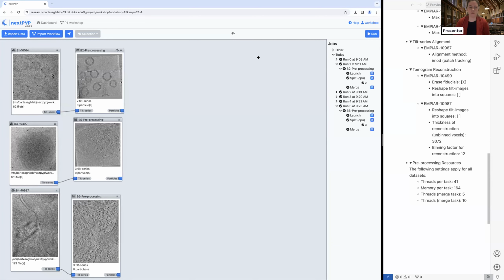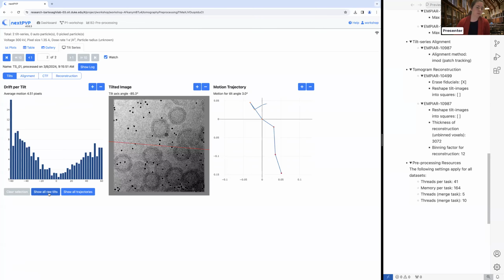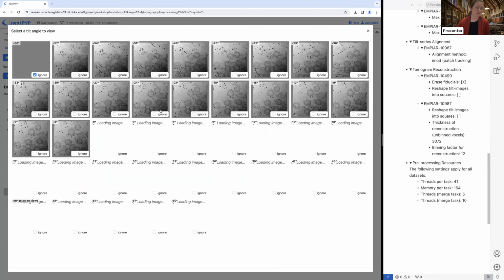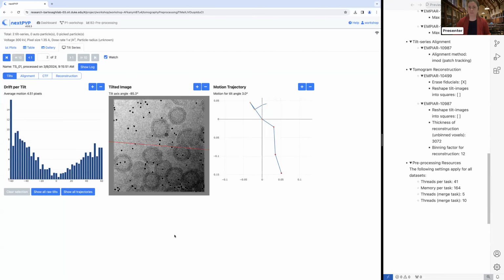Well, we'll click on our block. Yeah, so after you've run your block and can visualize your data, you decide you have some bad data, you want to exclude it, then you would need to rerun your block. This is just before you run the block, you haven't seen the data, so you wouldn't know to exclude it ahead of time, is why you need to rerun it.